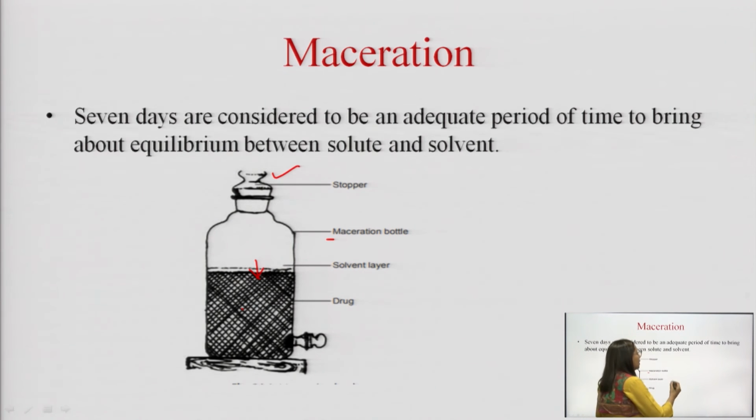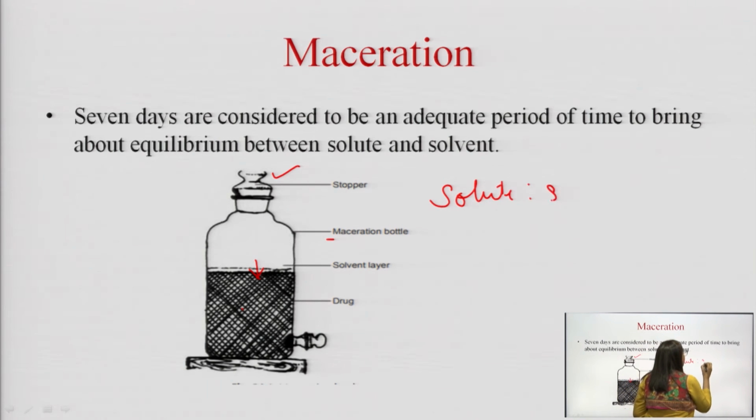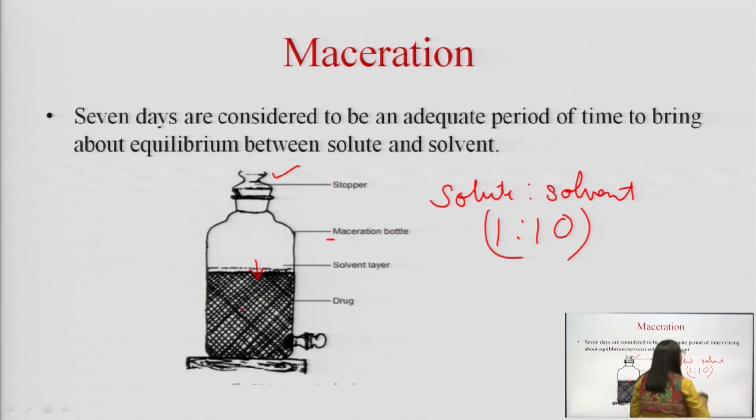Here the ratio with which the solvent volume is selected is 1:10, that means the ratio of solute versus solvent is 1:10.